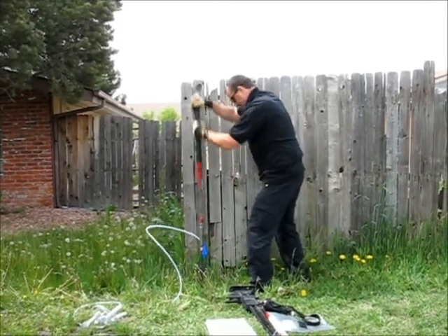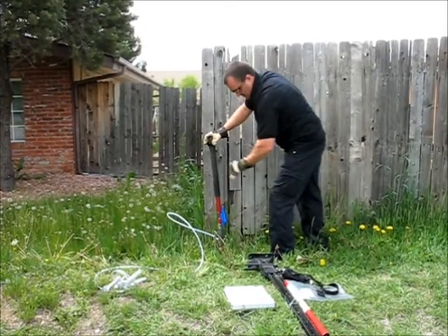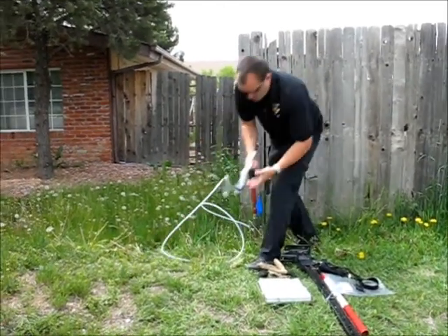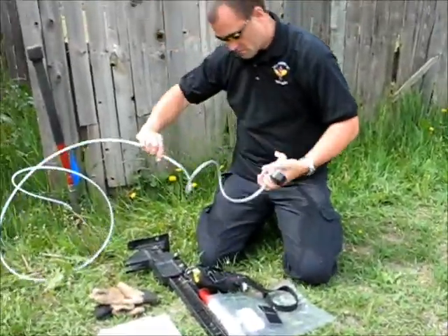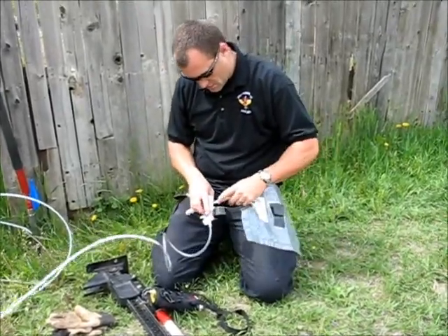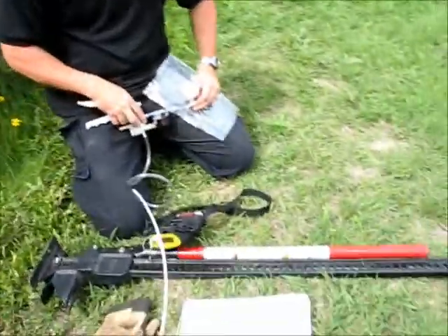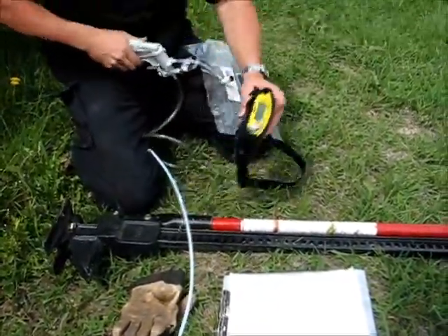Currently we're driving these down to a depth of one meter. Once we've got the desired depth, we take a hand vacuum pump and draw an air sample into a Tedlar bag. Then we draw a sample back out of the Tedlar bag into a direct read instrument.